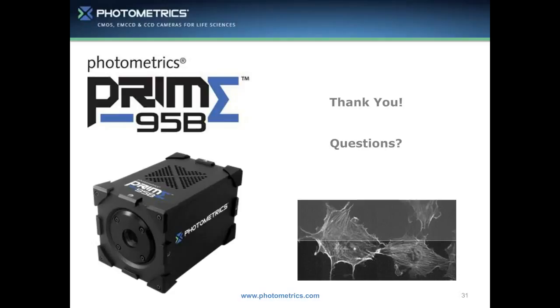And is denoising done in the camera or on the computer? The denoising is actually done on the camera itself. Our implementation is done on the camera head. There's an embedded signal processing engine that we've placed on the camera to give you this data in real time. And the reason for that is being able to get this data in real time and not having to post-process and take the time to transfer all of that data, it allows you to get better results immediately.